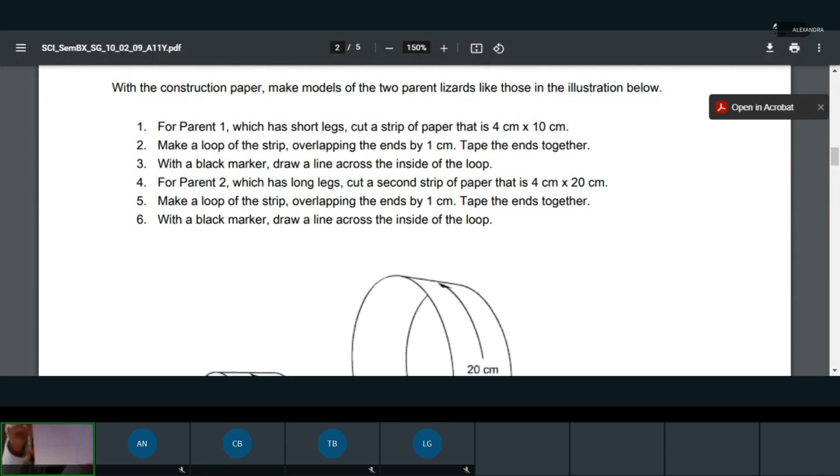Sure. So if you take a look, remember I drew my 10 centimeter line right here. And then I measured from this edge of the paper in to the paper, I measured it 4 centimeters. Well, that was my first mistake because I didn't put a marker. I just drew a whole line 10 centimeters long. Well, that's okay too. If you drew a line 10 centimeters long, you can just draw 4 centimeters from there. I'm just going to start over. Okay, whatever works best.